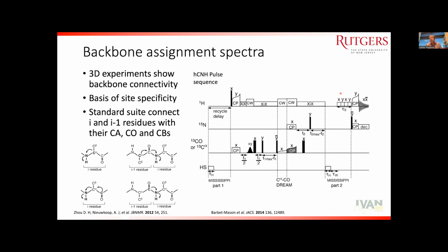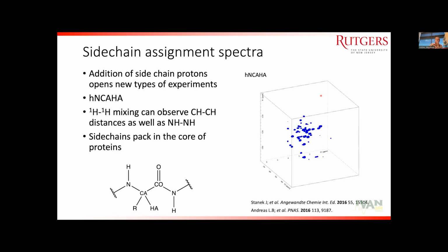It's apparently going to have a good talk about that in a couple of months. In the solid state, we use a combination of presat and a homospoil if we have it. And then you come back to your protons and detect your residues.